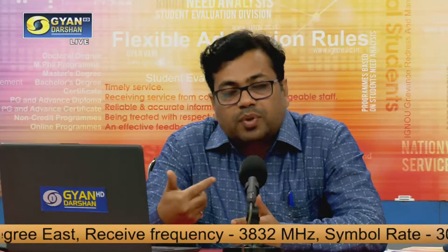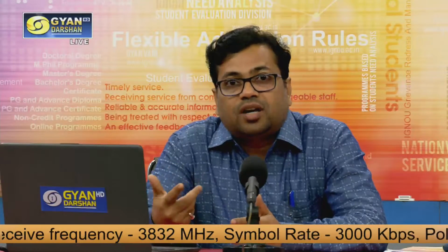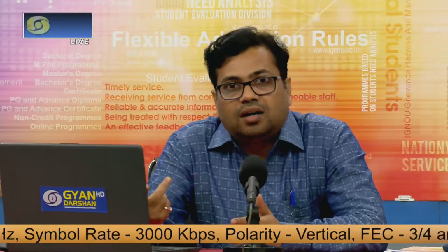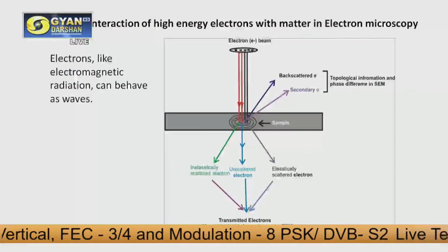Some electrons only interact with the outer electron orbitals of the atoms. Some electrons move out of their orbitals and leave the atoms. These electrons are called secondary electrons.